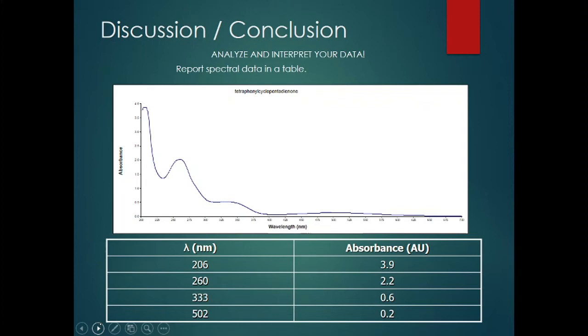In fact, the absorbance depends on concentration, so if we increase or decrease the concentration, the absorbance goes up or down accordingly. But what we are looking at here is the relative conjugation. We're not interested in the other aspects that you can get from this. Sometimes you can correlate peaks with particular chromophores. For example, benzene rings typically show up around 255. So if you have a peak in that region, you can often associate that with one of the transitions in a benzene ring. We're not looking at that.